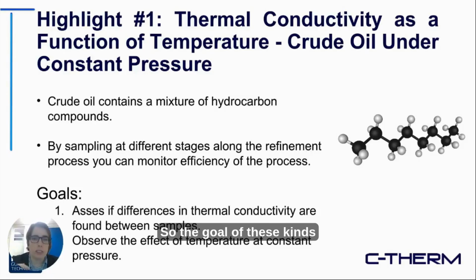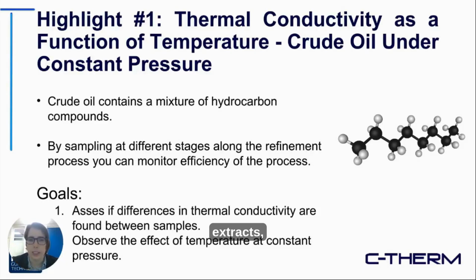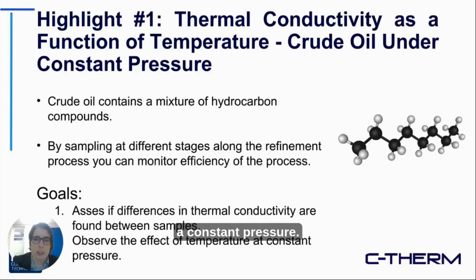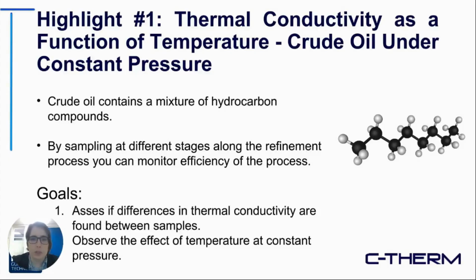So the goal of this kind of work is to see if the thermal conductivity is different between different sample materials, between different oils, for example, or different extracts, and also to observe the effect of temperature on the thermal conductivity of the oil at a constant pressure. This becomes important looking at the thermal management of, for example, oil pipelines to make sure that you're providing enough heat to them so that they don't start to approach their wax appearance temperature, as one example.